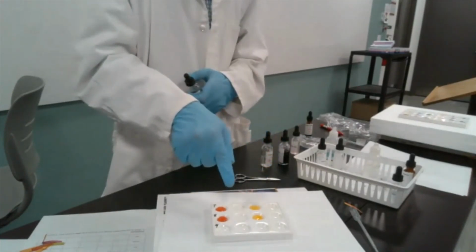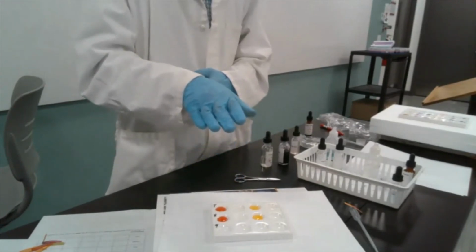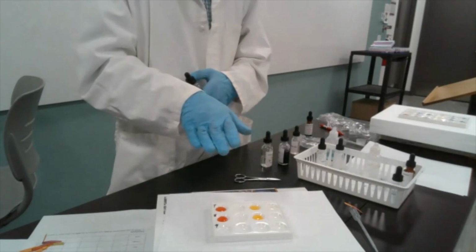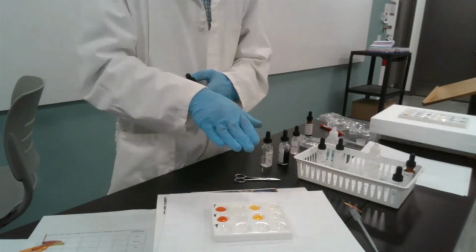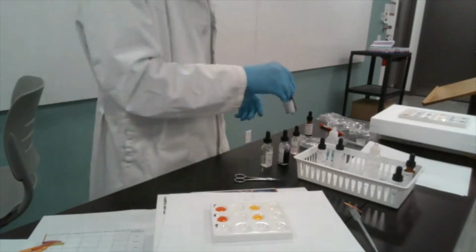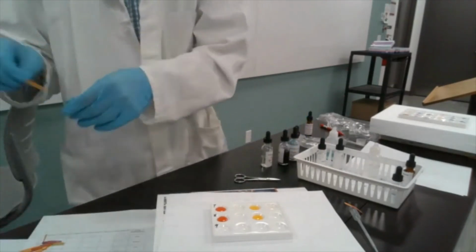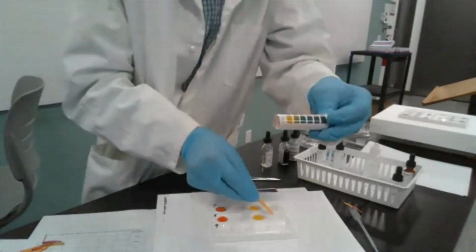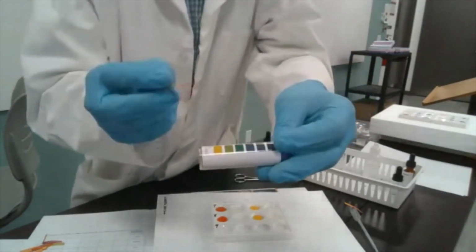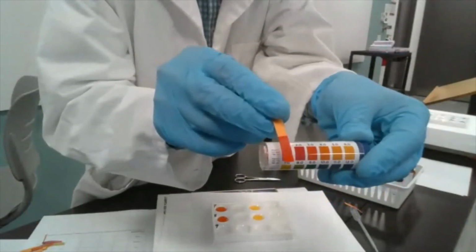So you see that the color pattern that we're getting with the 3 indicators for vinegar is the same as that for pop. So it's almost like, if you're drinking pop, you're drinking vinegar or something, pH-wise. Let's see, we get the same kind of response with the pH paper.